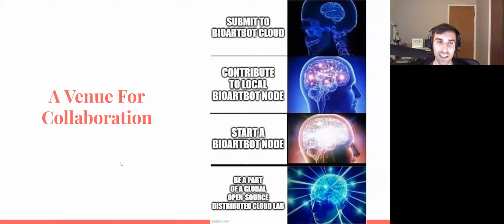I'll come back to my meme here. The vision, as it comes from this thing we've been calling BioArtBot, and moving it into this distributed cloud lab concept, is that you could take this idea and it could be your venue for collaboration. The way Git is really good at helping you collaborate with documents or project work, you could imagine that BioArtBot, or its little brother, Distributed Cloud Lab, could help you collaborate around scientific protocols.